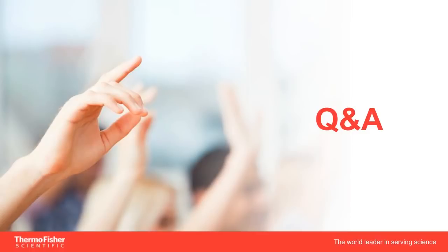Yes, so Bis-Tris gels can be used under native conditions. We do have a new native PAGE gel, which is a Bis-Tris gel, and it does not have any detergents, obviously, and it is meant for running protein under native conditions. And yes, Bis-Tris gels would provide a better result in preserving sample integrity over a Tris-Glycine gel that is run under native conditions.